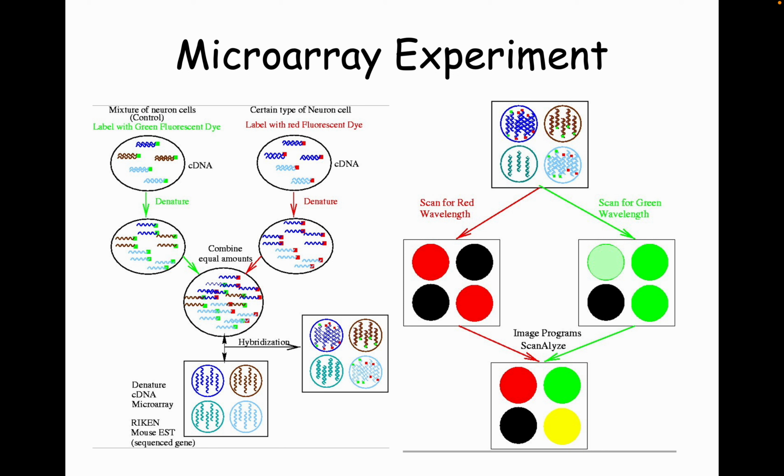We've also done it with enzyme activity. So if you have a sample from a cell that has perhaps some kind of viral disease, they make these substrates, which are chips, which are kinase substrate chips. So for example, there are serine threonine kinases, but they bind to a specific protein.